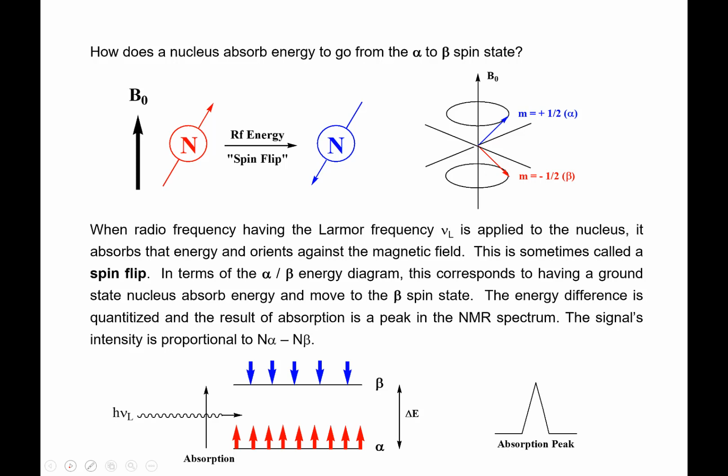We need to put the sample inside of a magnetic field. When you have an MRI done, you are the sample inside of the big magnetic field with the magnet. We take samples, put them in little tubes and drop them into the center of the magnet. And then they spin. Don't ask me what the pounding sound is in the MRI, because I'm not an MRI technician, but that's the thing that drives people off the wall the most, the pounding of the instrument.